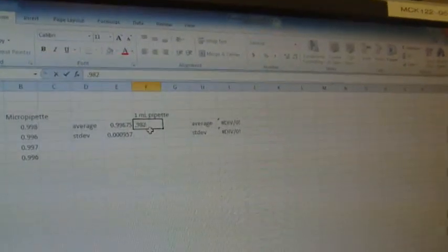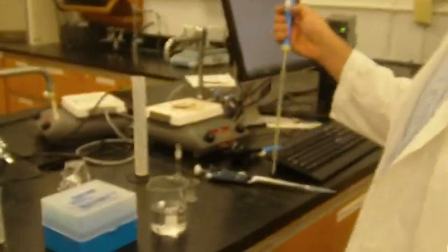But we can put them in as we go, right? Now what number is this? 0.982. All right, great. So we do that one 4 times, correct? Correct.